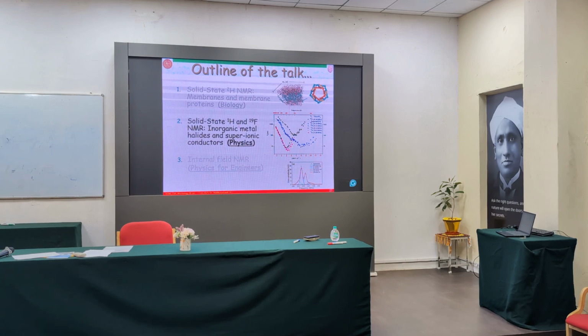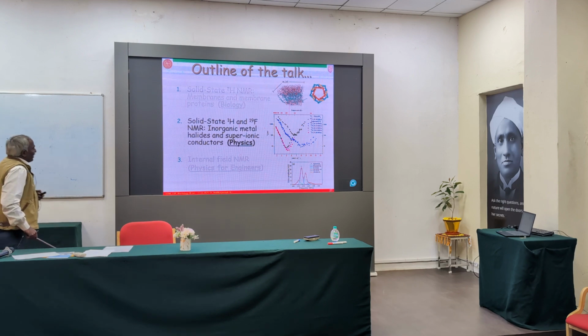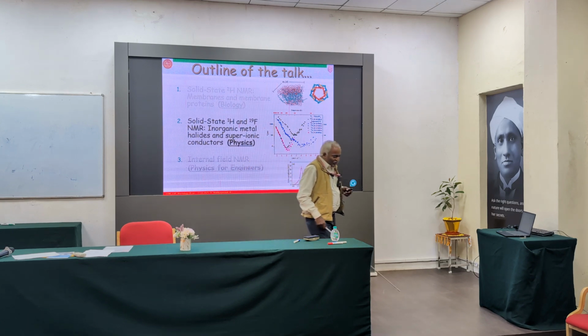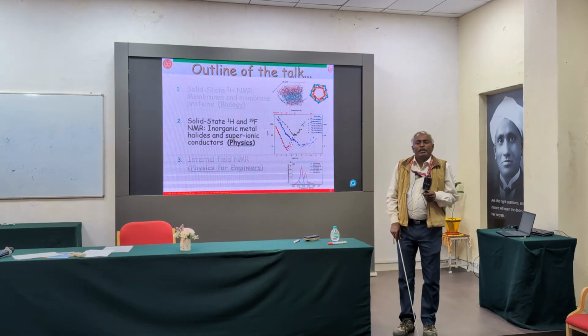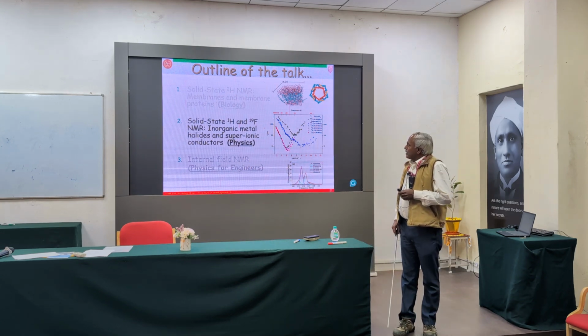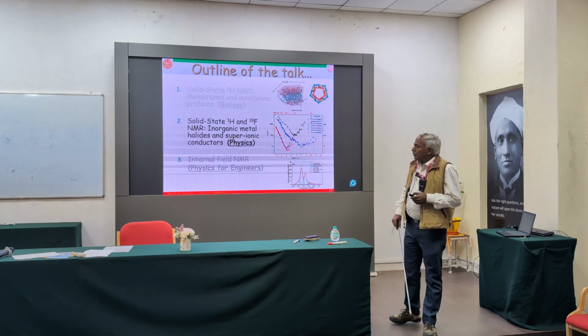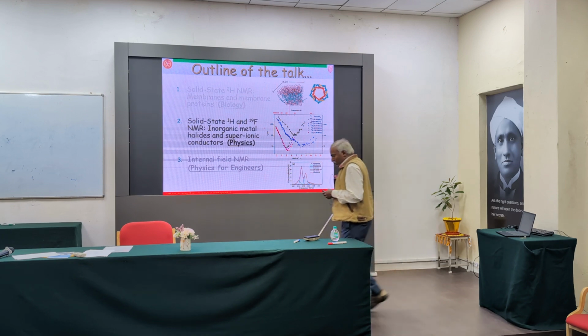Now we will talk about inorganic metal halides. We will be talking about a couple of representative examples of how, in real material science, one can use solid state NMR. Again, I have to admit, probably tomorrow Dr.